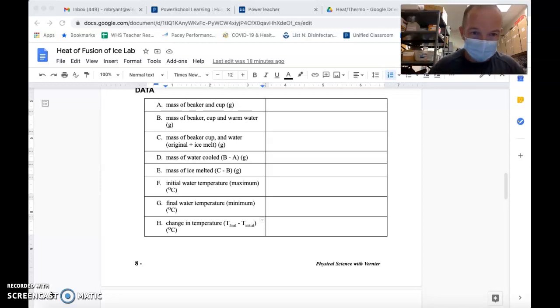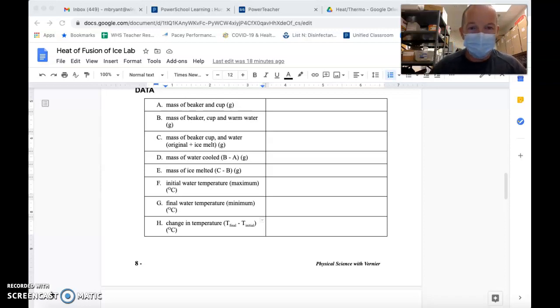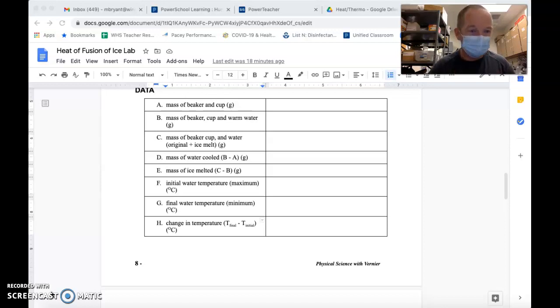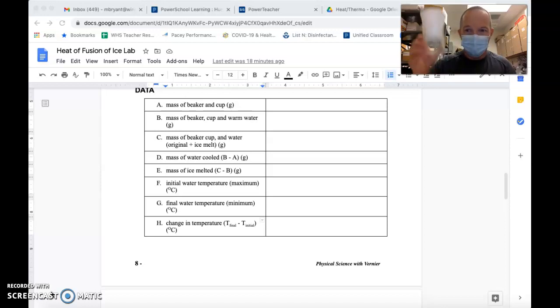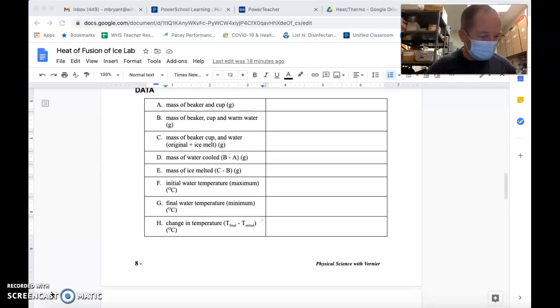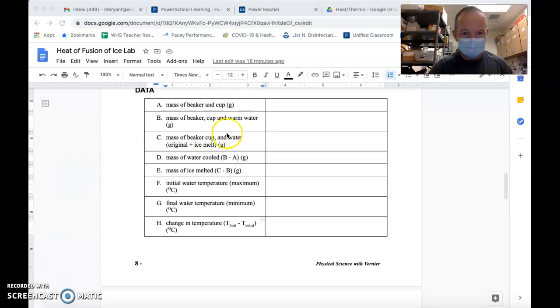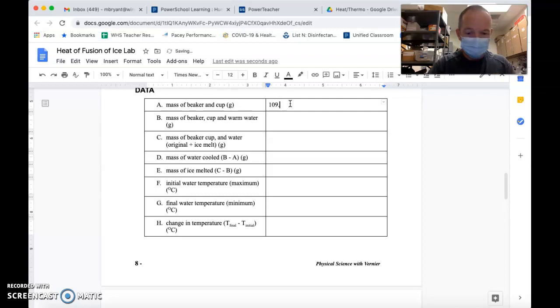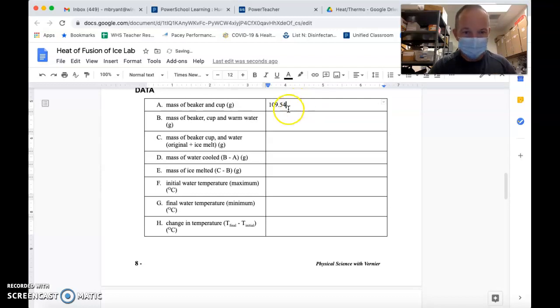What we're going to do here, I have scrolled down to the data table for this lab. It's a very simple experiment. Here we have a beaker and a cup, which you see right here, and I'm just going to get the mass of that, which I am recording here, and you're going to have to trust me on this, as 109.54 grams.